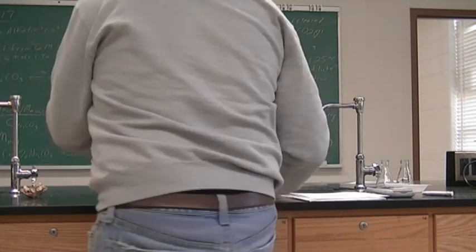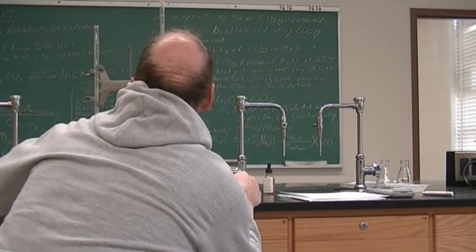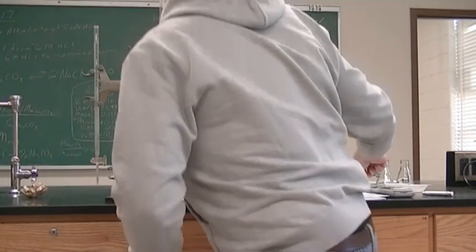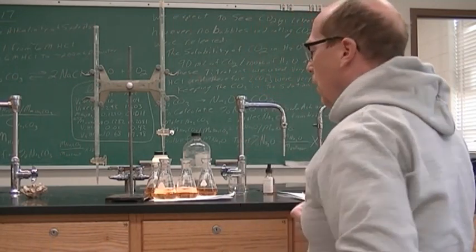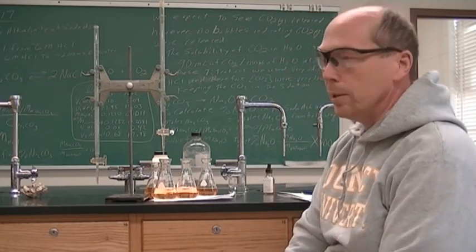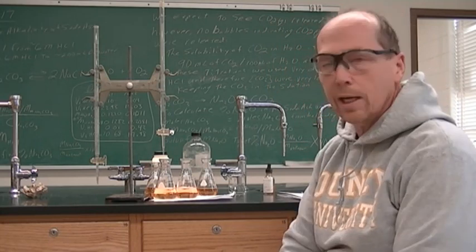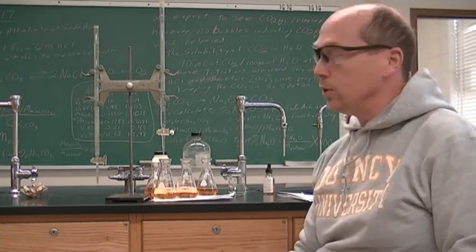All right, we just need our final volume of our HCl, which is 19.00. All right, so that gives us our three runs for the pure sodium carbonate, and three runs for our unknown soda ash. And our water was tested and it was perfect. Nothing wrong with our water. All right, that is the end for experiment 17.